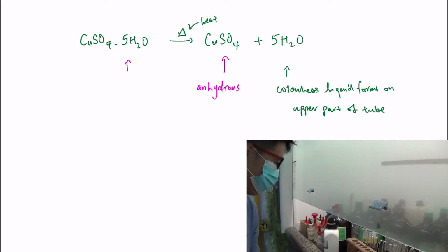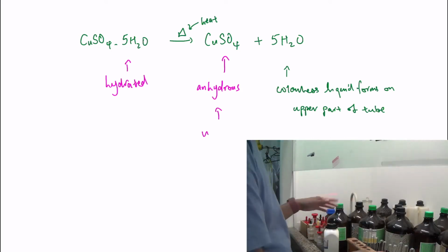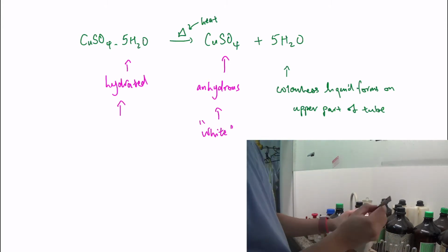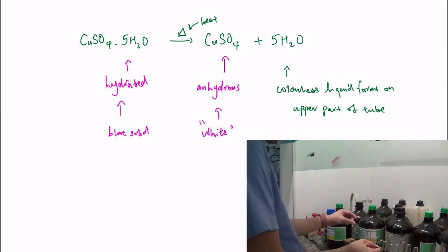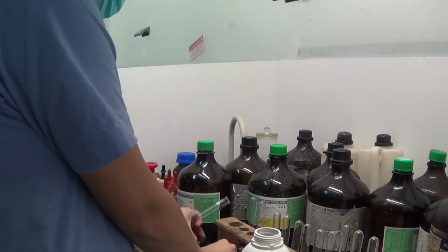Okay, I'm back. I forgot that the best way to do this, in the absence of a properly working ventilator, is to just wear a mask to prevent me from smelling too much of this ammonia. Like I said, we could use the hydrated or the anhydrous. It shouldn't matter that much because we're just going to dissolve it in distilled water anyway.